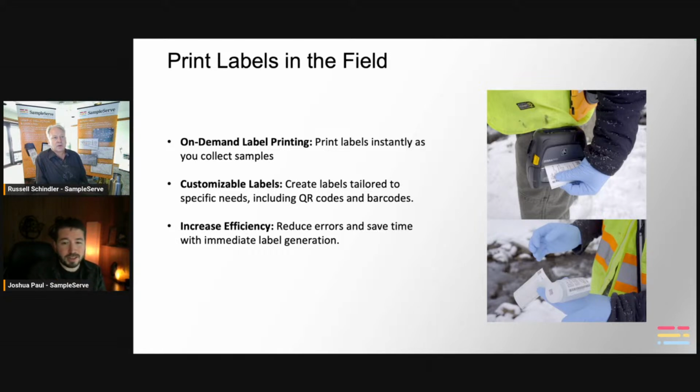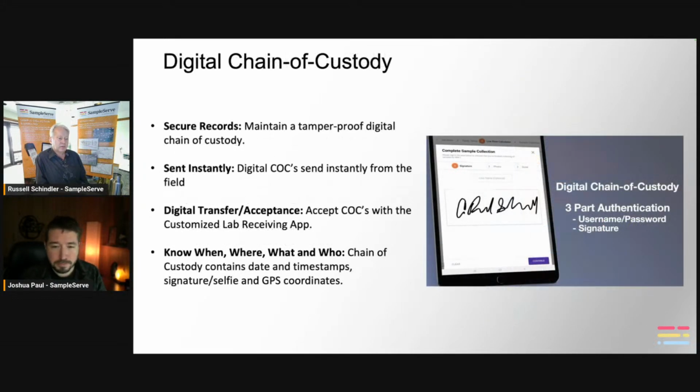So it throws that on the label as well, and it has all the other information on the label too. Their thermal label printers print, if you opt for the in-the-field printing. And it's on a polyvinyl label, so it's totally waterproof. It won't smear, won't wash off. It's a really good label.